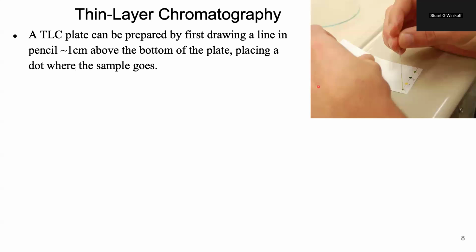Now, when actually trying to prepare TLC plates, the first thing you're going to do is draw that pencil line somewhere around 1 centimeter from the bottom of the plate.